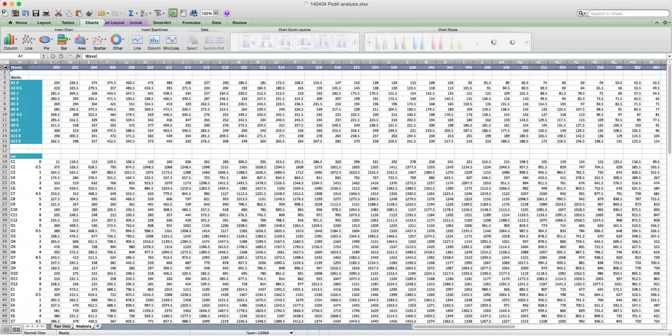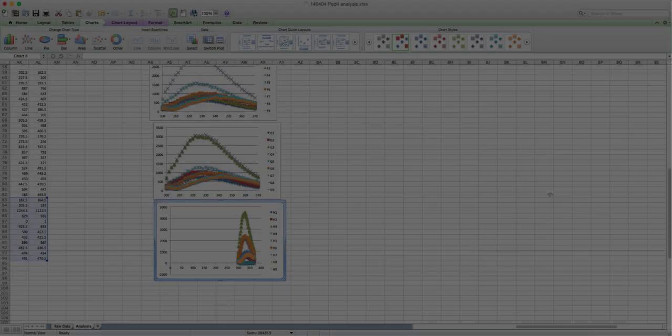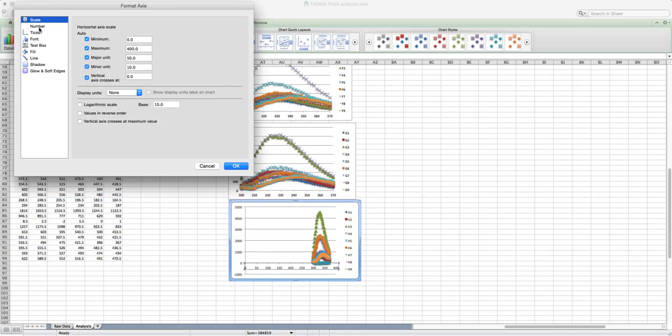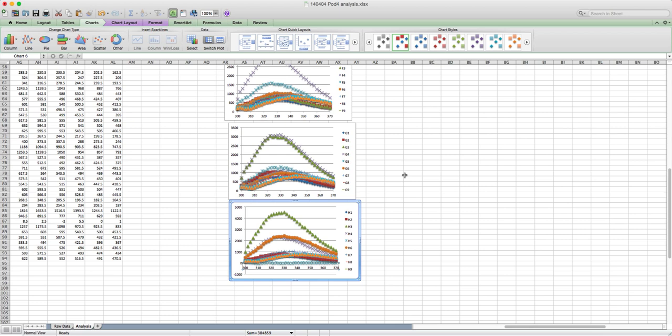Let's see if the other ones look a little bit better. Yeah, so it seems like in the case of the mutant, across all of your replicates, there's something going on with the amount of protein. At this point, I would probably go back and think about how this experiment was set up, whether different people pipetted things, or what may have happened that would contribute to this. Here in this one, you can see there's a case where there's no protein here, and extra protein here.